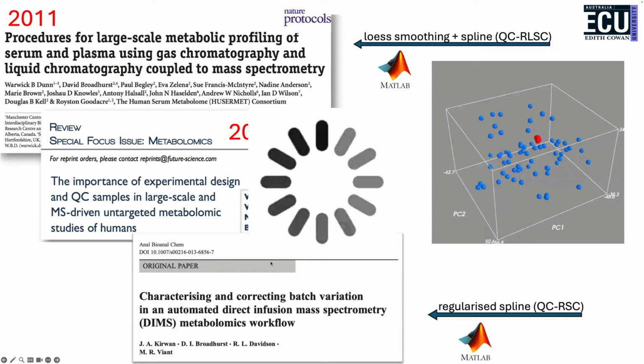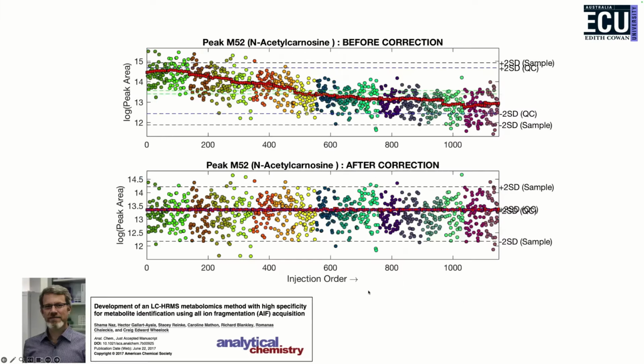At that point, things kind of paused in the publication space. Obviously, I was using this software on my projects, and projects that I'm involved with in Manchester, and then Cork, and then Alberta. And then there were various long-term collaborators on bigger projects who asked me to help them out. This is one of many examples, Craig Wheelock and his group.